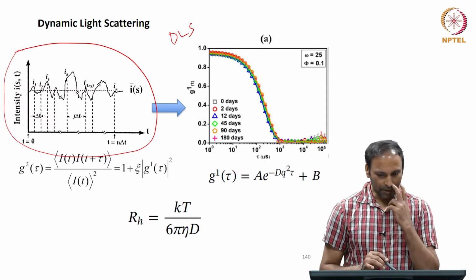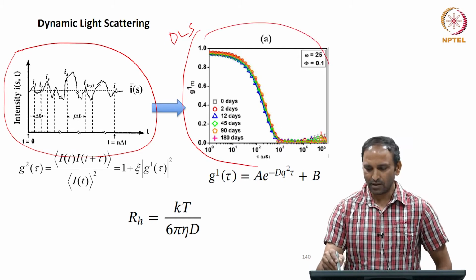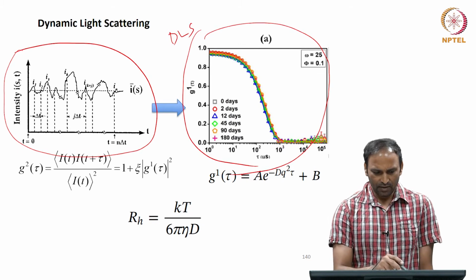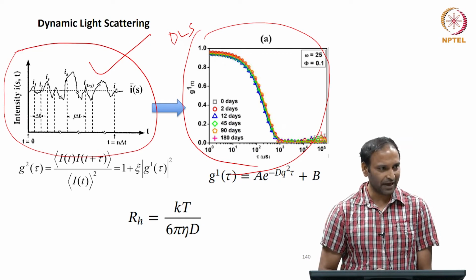But what they show when you use any particular instrument looks something like this. This is actually obtained from that scattered intensity measured as a function of time.